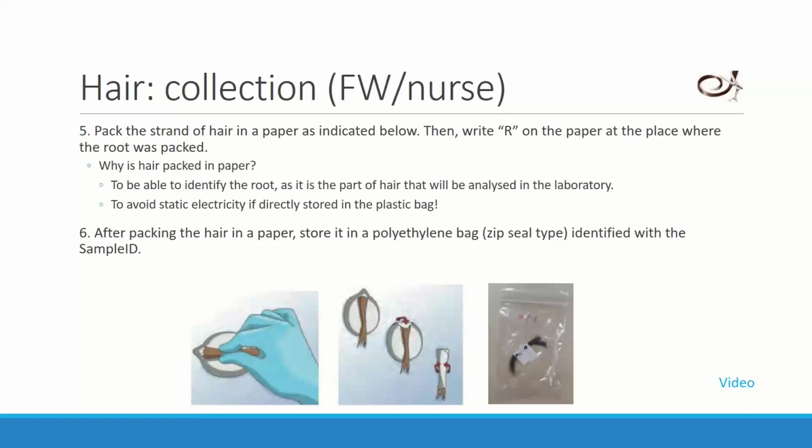because everything will be used for the analysis. Yeah, that's right. If it's like 1 centimeter, it's going to be difficult. But the paper should be used in any case, because otherwise the hair sticks to the plastic bag. So if they are really short, it's better to put them in a small envelope, a paper envelope, and then in the bag, so you avoid them sticking around on the bag.